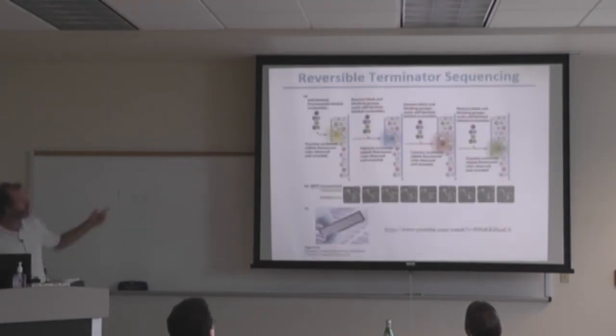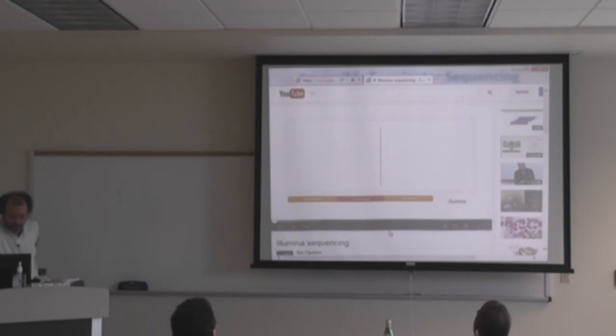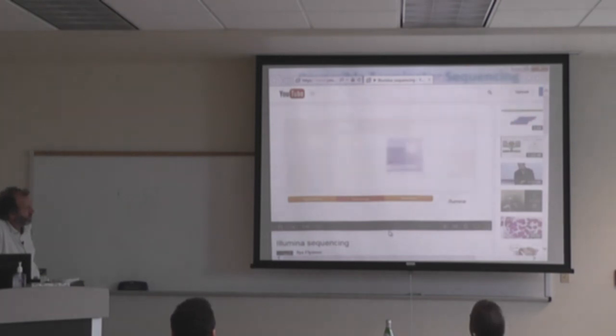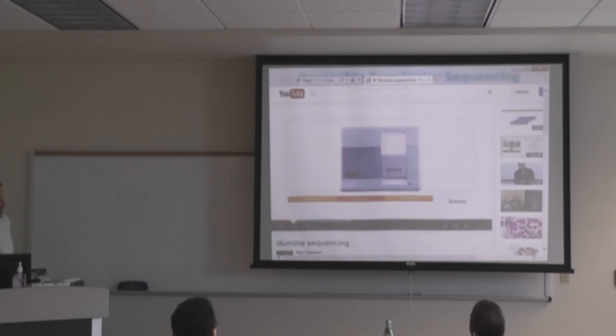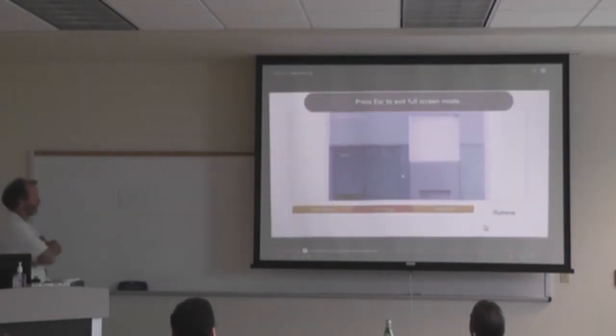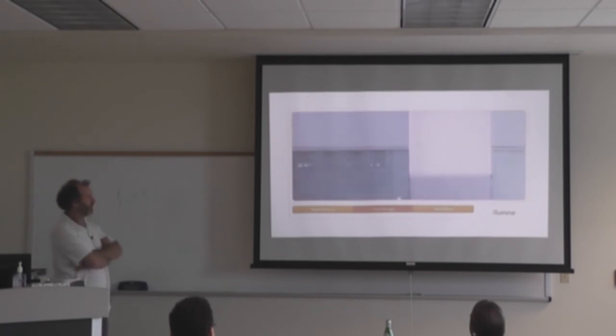So then there's reversible terminator sequencing, and they've got a nice video here too. The Illumina Genome Analyzer Sequencing Technology. The key to the genome analyzer's unmatched flexibility, accuracy, and ease of use is Illumina's sequencing technology. Let's look at the chemistry for the three steps in the genome analyzer workflow: library preparation, cluster generation, and sequencing.